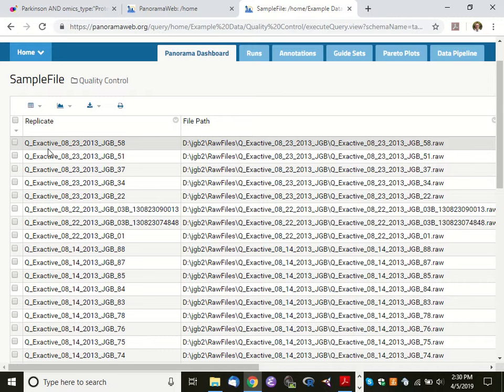A Q-exactive is a really popular model of mass spectrometer. There's a Q-exactive already in place at the Center for Proteomic and Genomic Research near Groote Schuur. There's another Q-exactive in the Jonathan Blackburn lab there. We have several of these around the country already. So I can tell you there's one over at what used to be called KRIF, over in Durban for that matter.